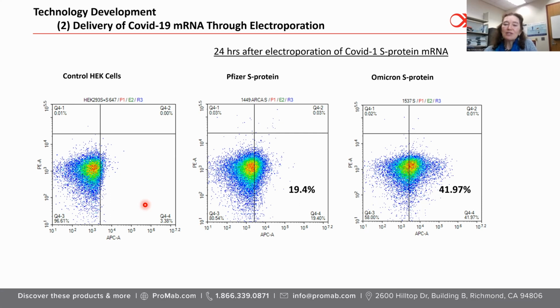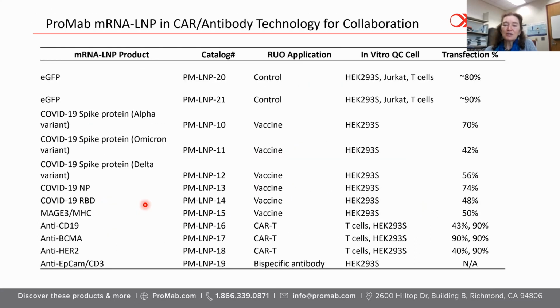There is no correlation with the size of nanoparticles, and mostly it depends on the sequence of your gene and the complex, but if the nanoparticles are too big, then it's not efficient. Yeah. Okay, so it's more related to the gene itself, how it can be expressed, but the particle size is not very critical in cell transfection. Yeah, we have found that there are variations between 80 and 100. There is no correlation. It's the whole complex of the gene plus nanoparticles. Yeah. I see. Thank you.